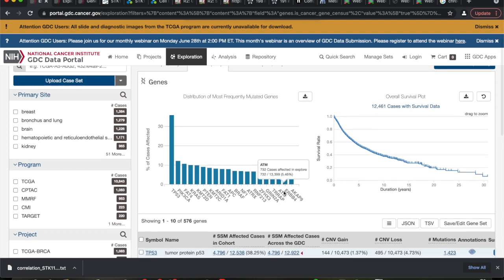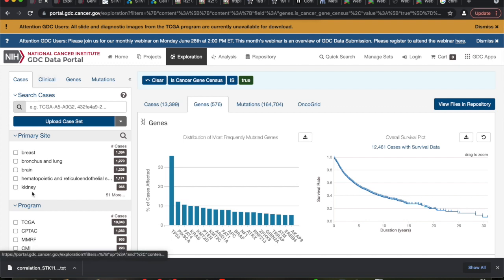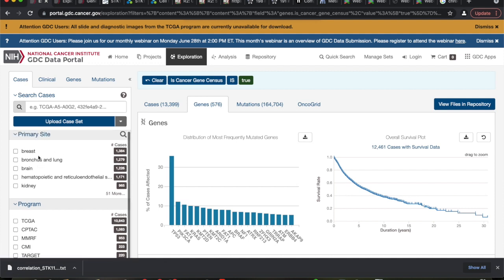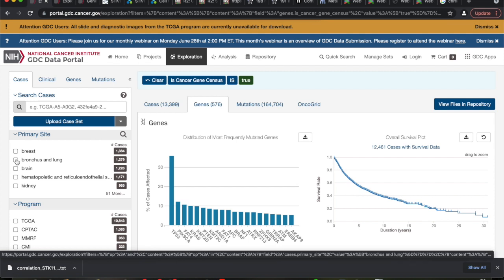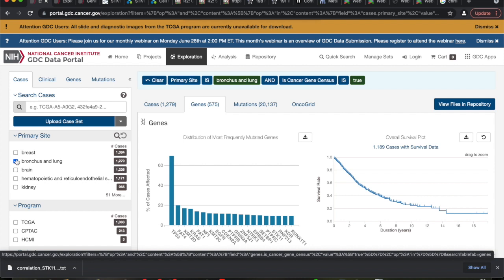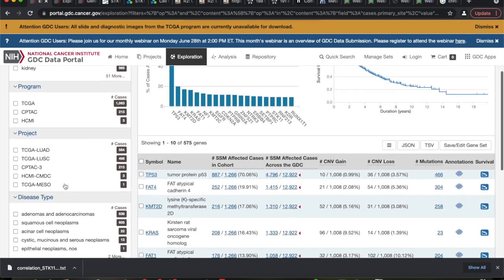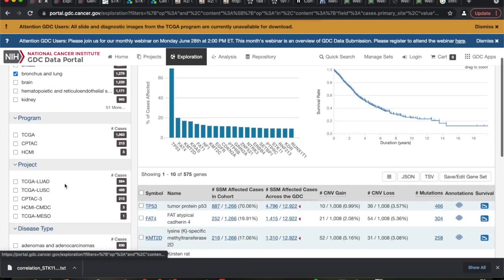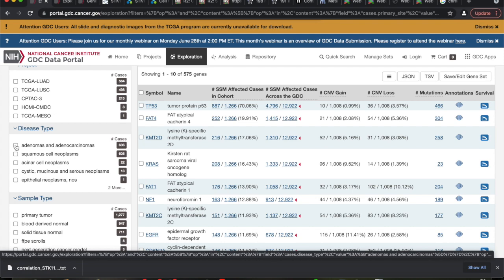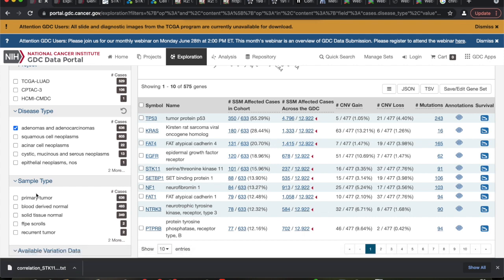A lot of these gangsters you're probably not going to measure directly, but you'll absolutely see their effects. Over here on the left we can filter the dataset. I want to look at cases found in the lung bronchus or lung, so click that. Also I want to look at adenomas and adenocarcinomas. Adenocarcinomas tend to be a more severe form of cancer, so let's look at that.